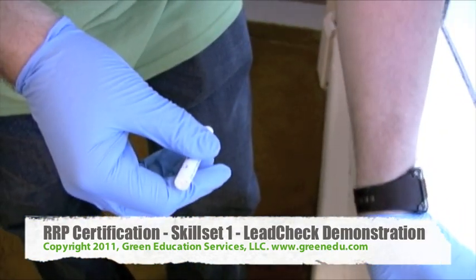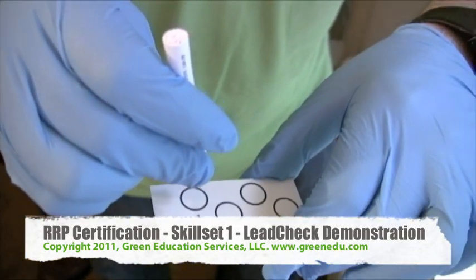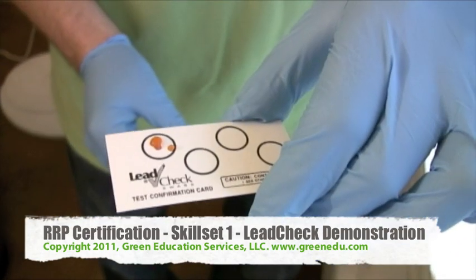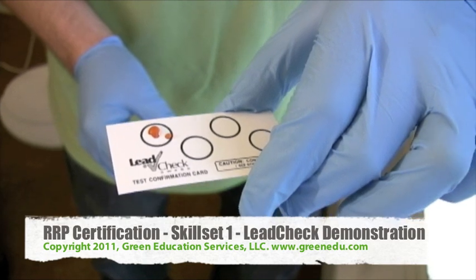Gently squeeze the barrel until the yellow liquid comes to the tip of the swab. The swab is now activated for testing. Drop a small amount of the yellow liquid onto one of the circles of the testing card. If the droplet turns red, the test is working properly and will not give a false reading.